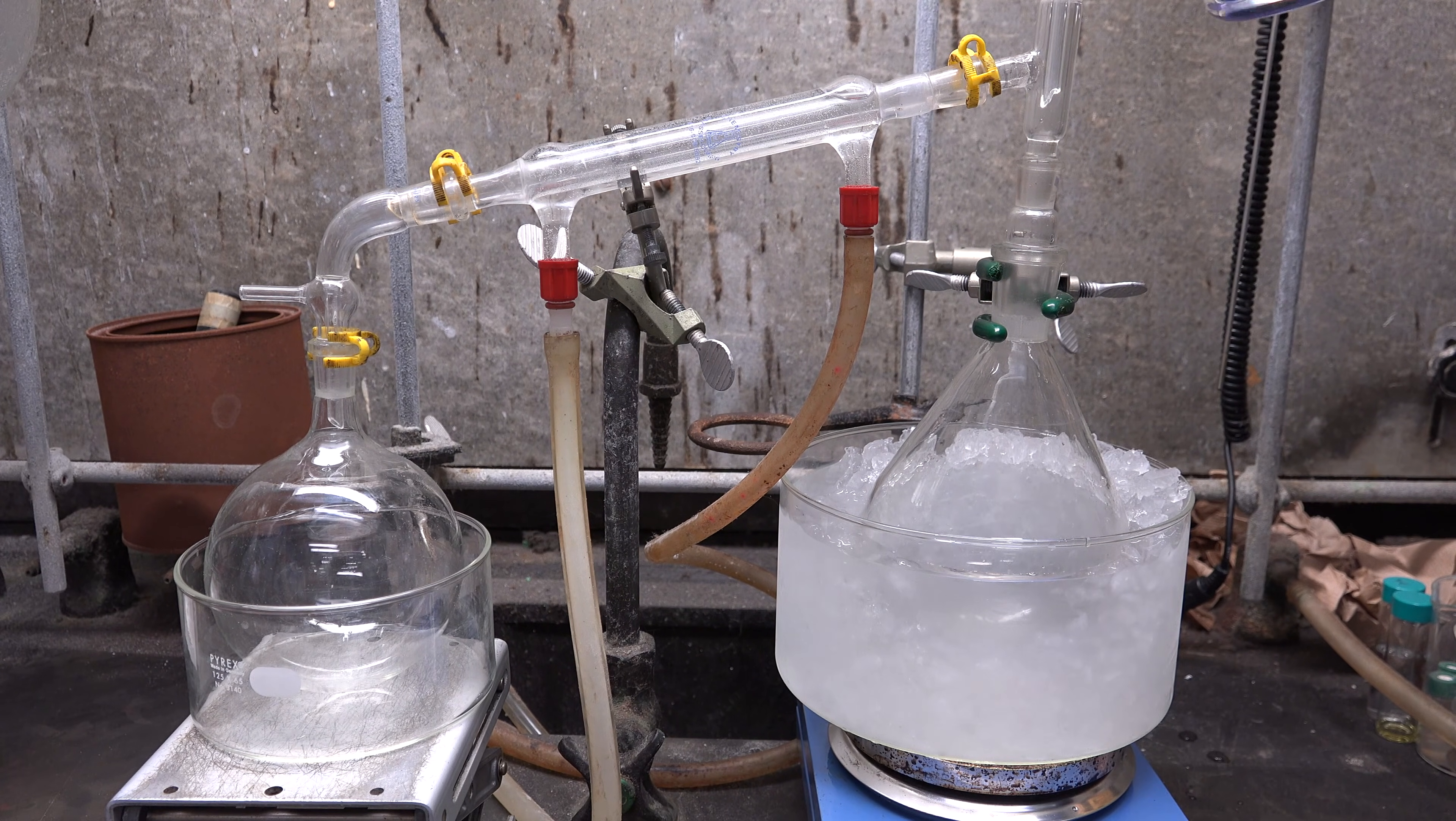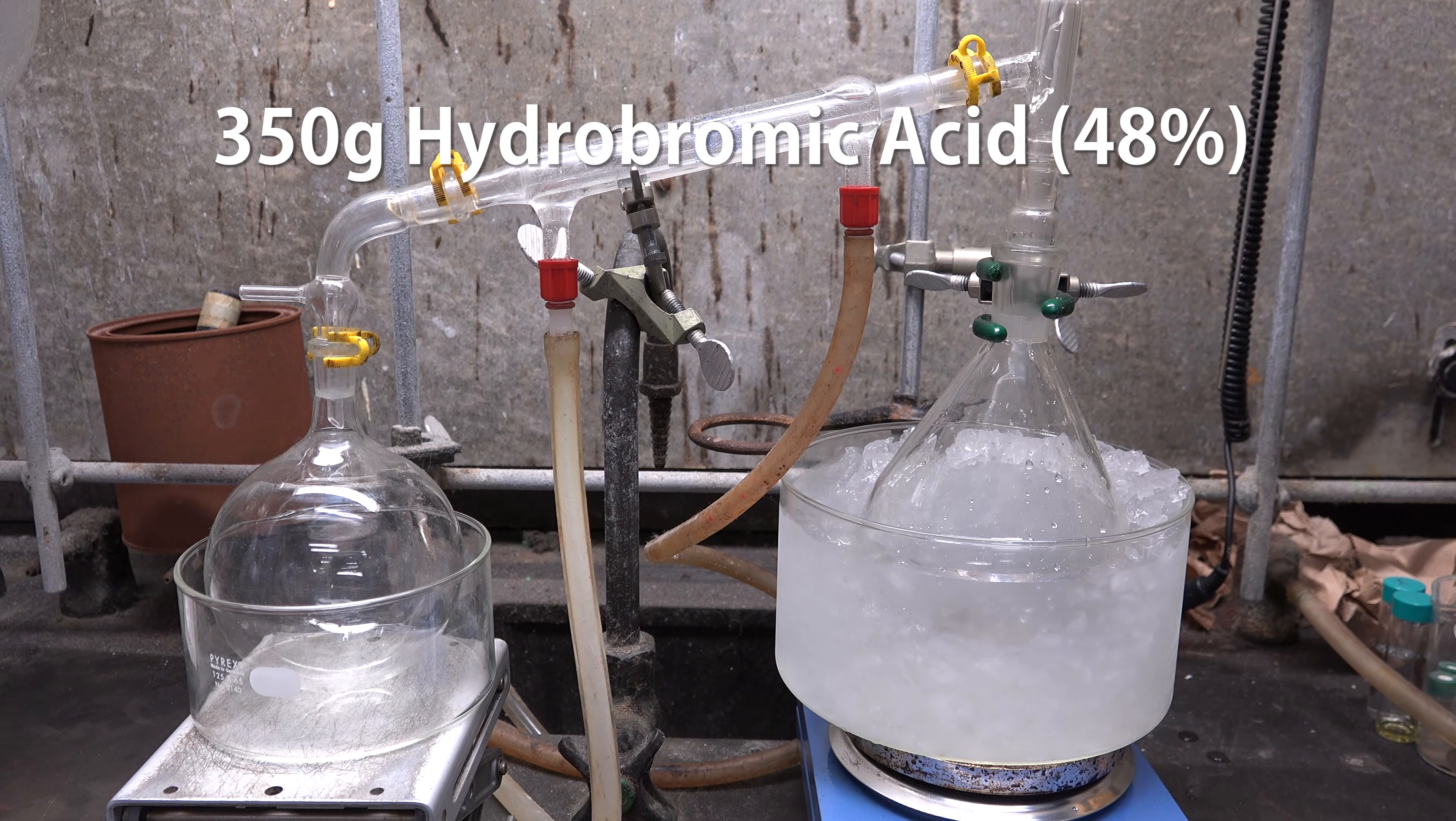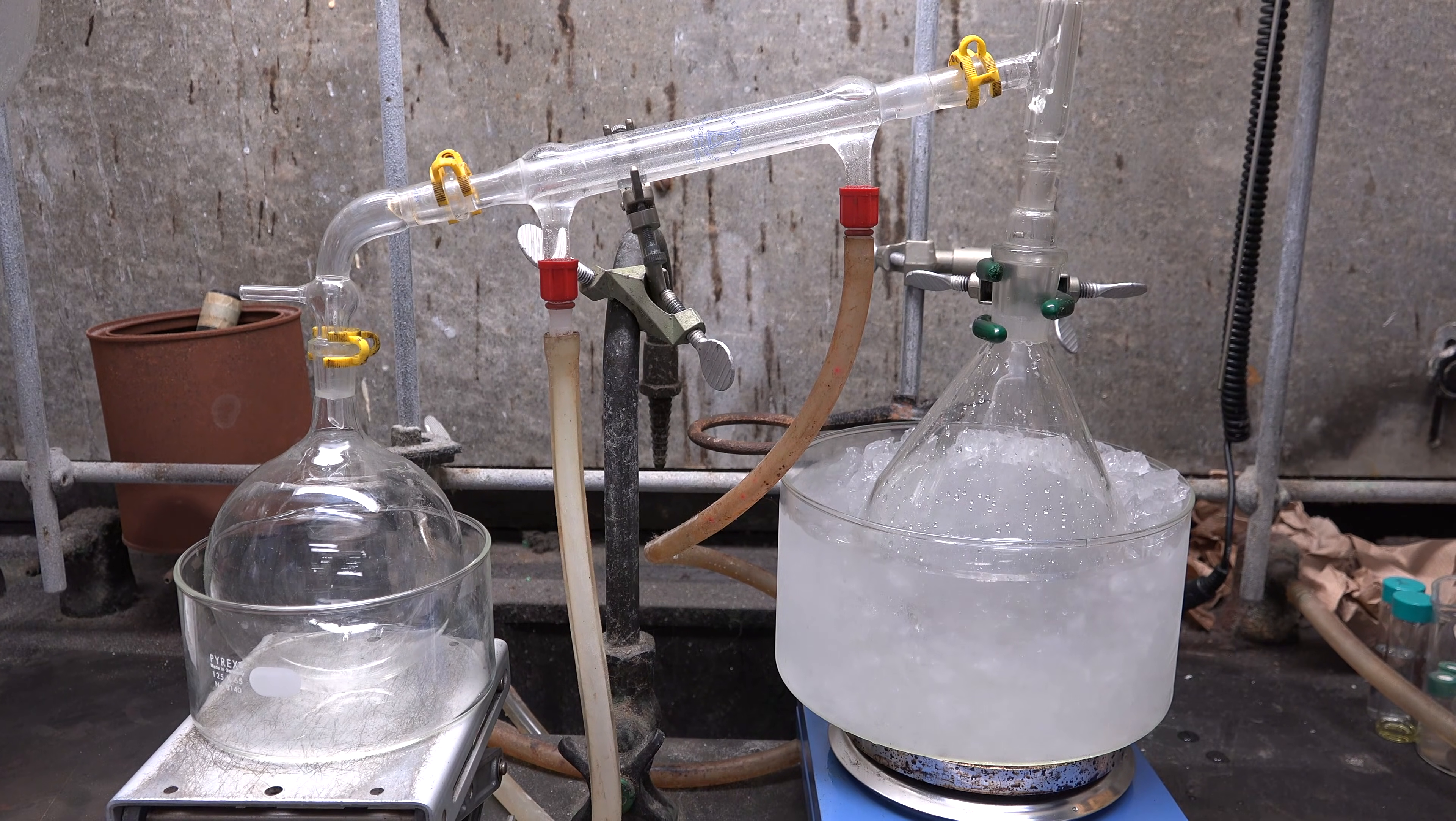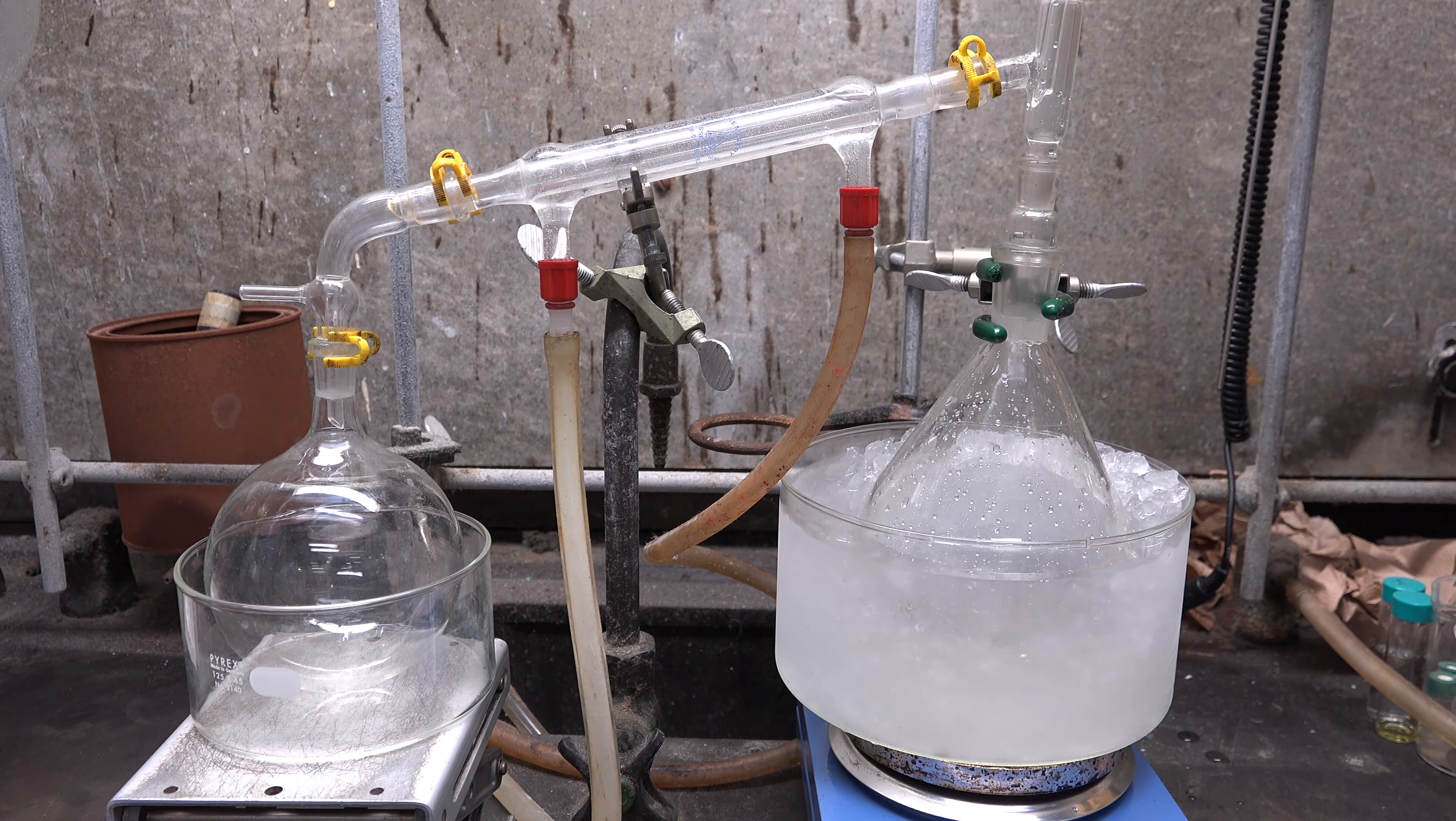Once it's packed we add in our bromide ion source. In this case about 350g of 48% hydrobromic acid. We actually showed how to make hydrobromic acid in a previous video. You can check the video description for the links.